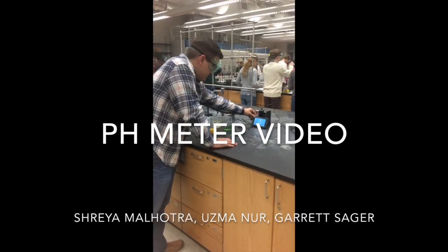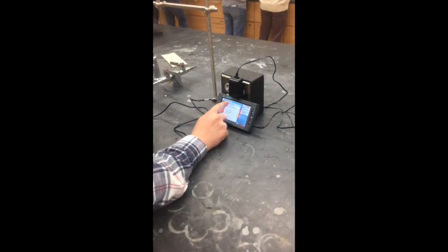In this video, we looked at how to use a pH meter. When using a pH meter, it is important to understand what it is measuring and what it relates to.